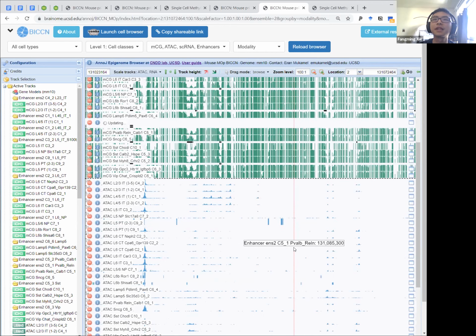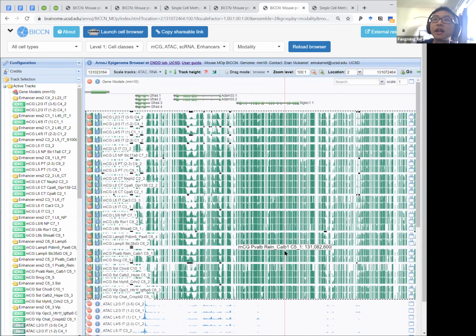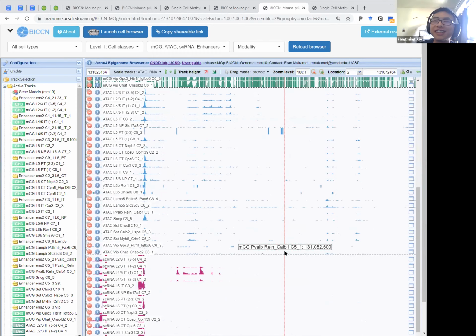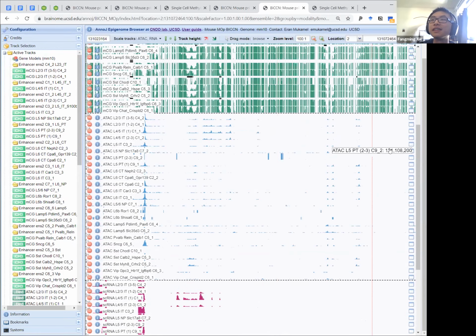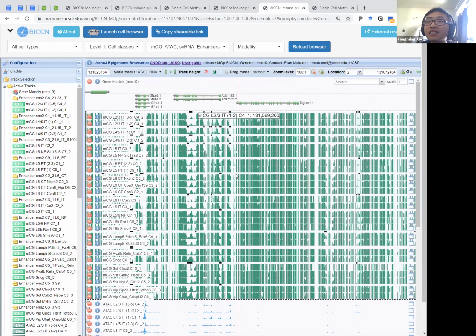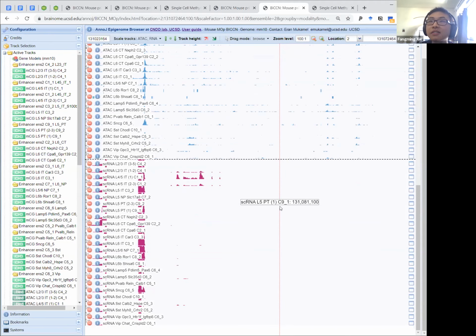Okay, now it shows you all the cell types at this gene location, single C. I'm not sure about single CF. Is it a different gene? It looks like it's not expressed in any of the cell types here.